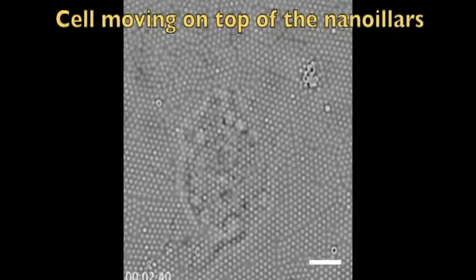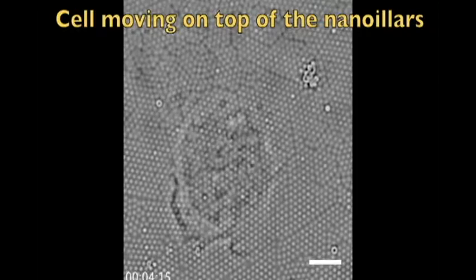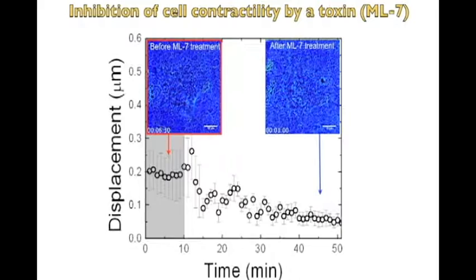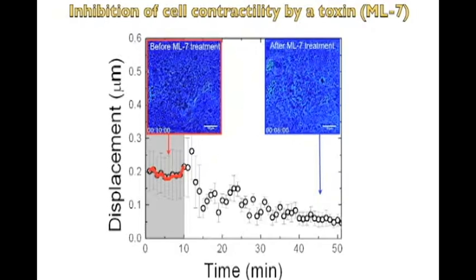This video shows how the cells move along on top of the pillars. The cells deflect the pillars one after the other - all together there are 2,000 pillars per cell. If the cell gets exposed to a toxin, you see how a living vital cell turns into a lame duck within about 10 to 15 minutes.